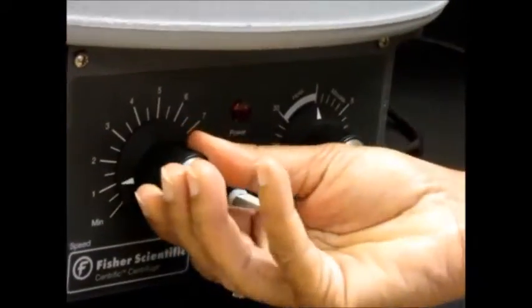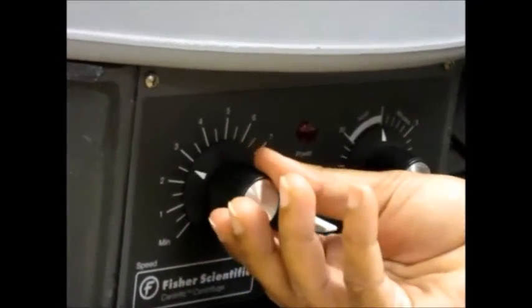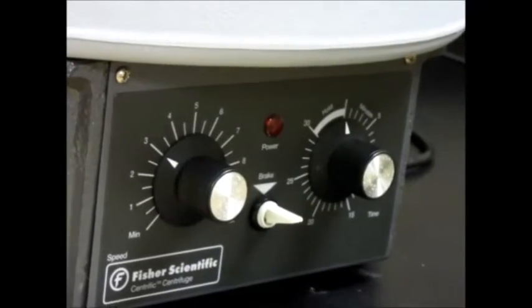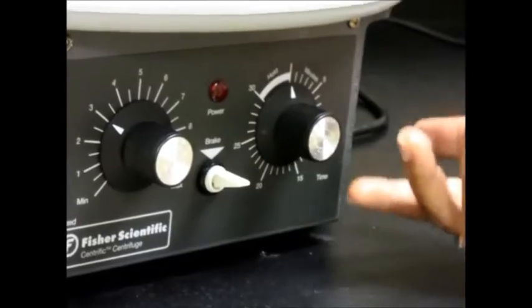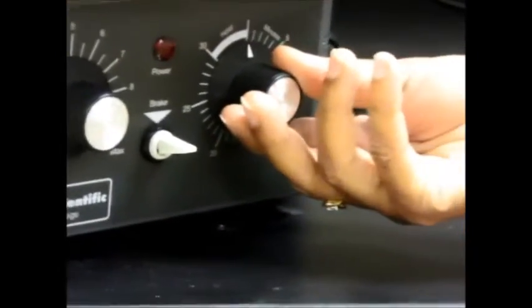Usually for the spinning you can have it at about two or three, and that's usually fine — it's enough for our experiments. For the minutes, you will generally need one minute of spin for the experiments that we're doing.